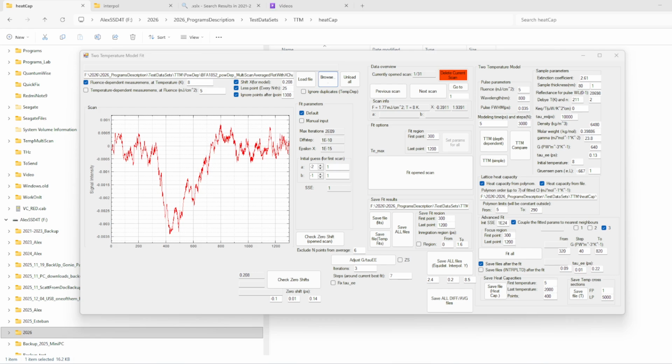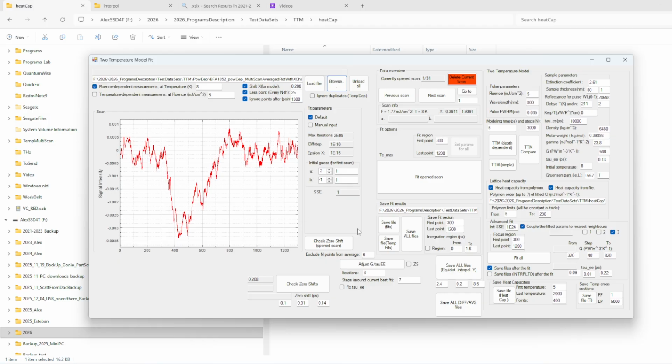In this video, I will go quickly over the window, a quick overview of the program, and I will show maybe some of the details that I will not go through in other videos, a little bit of historical background, why the program looks like it looks, because it's still in development. I looked into cleaning all the bugs, changing the fit algorithm recently, and adding the couple fit, a very useful option. So here it's more about the user interface and the routine.